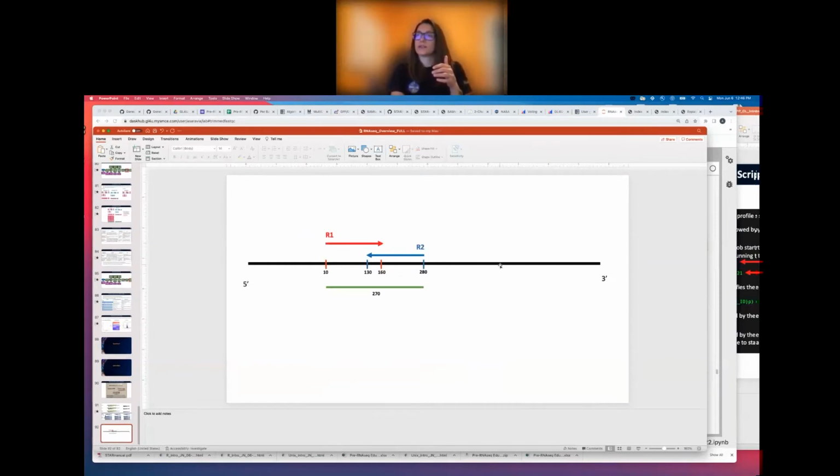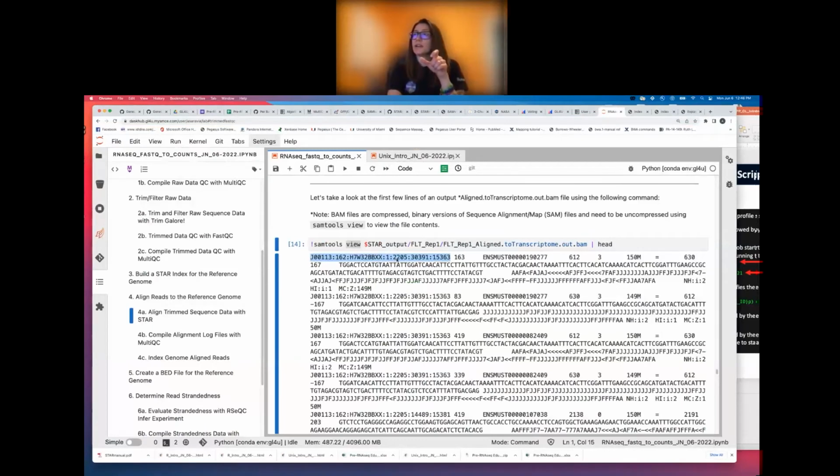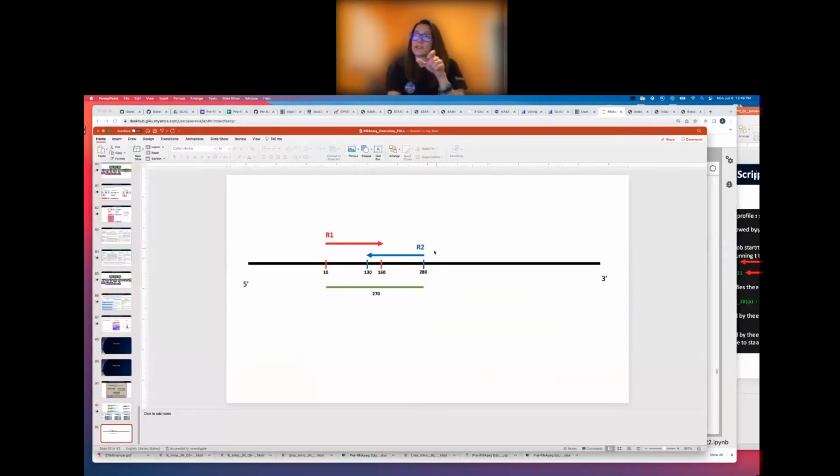So here's our reference genome. It's going to look for where this sequence maps best to this reference genome, and it's going to check both directions. So it's going to see how this maps back to this reference genome, if it's in this direction, or if it were the reverse complement of that direction. So how it orients itself relative to the reference. And so your template in this case here is green. So again, that green bar is going to have the same address in the read header for both sequencing it in this direction and this direction.